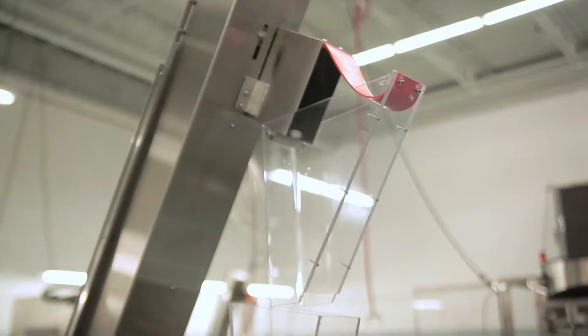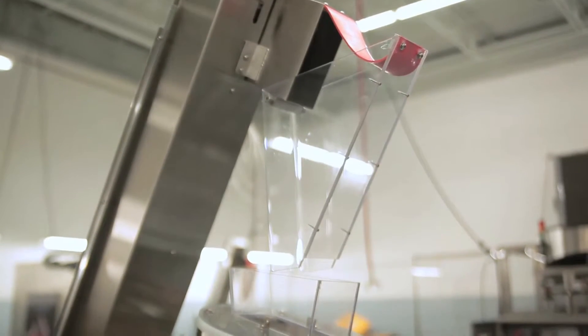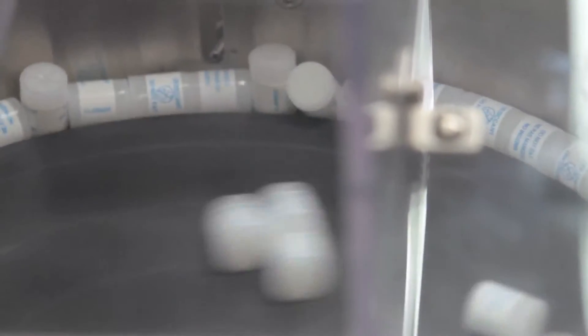Canisters are elevated and delivered into the canister feeder disc sorter to align them single file prior to exiting the vertical drop chute.